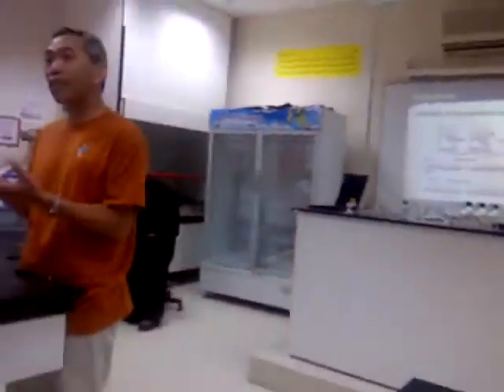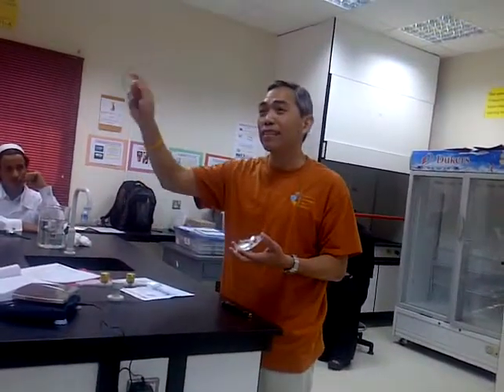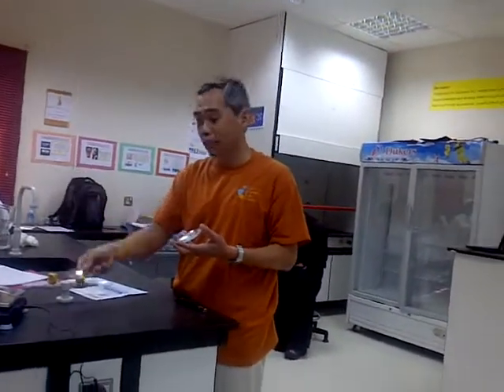0.8 grams. 2 grams. Did you figure out how much it had before? It's too bad that we didn't wait one class before we called it, so that we know exactly how much polymer we have. We can't wait now. But now each glass is different. They're identical glasses, but I don't think the weight is identical. Right. But you can get an approximate. Even though this is all gone, this gives you an approximate weight. So with that, try to calculate how much weight percent it increased. Okay, can you do that now?